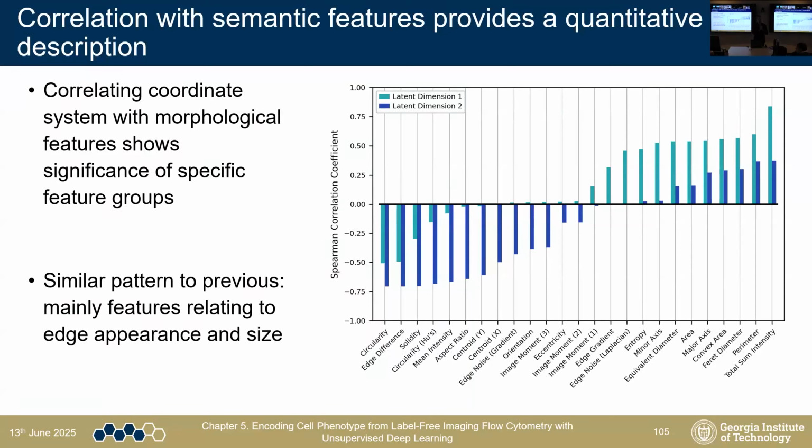So we actually can do a more quantitative scoring of how the different latent dimensions correlate to physical parameters that the ARTiMiS measures. This slide wasn't included in the main part mostly because it was rendered for print, and so the text is kind of small. But if you squint at it, you can see that there are different specific measurements that have semantic meaning. So circularity is how circular it is, and there's a mathematical formula for that, et cetera. And so this is a Spearman rank order correlation comparing each of the two latent dimensions, that's the cyan and the blue respectively, against some of the features that ARTiMiS measures. And like you said, subjectively, some of them are bigger and some of them are fuzzier, et cetera.